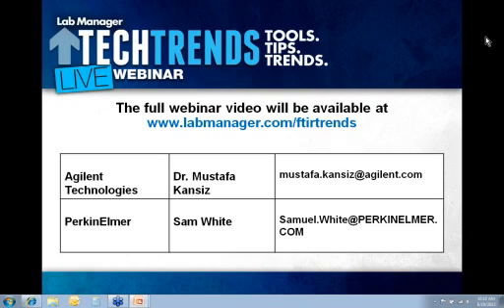Sure. All right. The other question is, a lot of the pharmaceutical analysis are now switching to using near-infrared or Raman scattering in place of FTIR, particularly for identity testing. Maybe one of the reasons is because FTIR, at least I think, has issues with sample prep. Could either of you comment on that? You want me to go first? Yeah, go Sam.